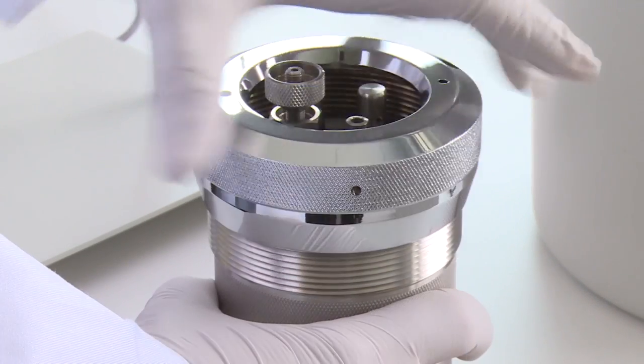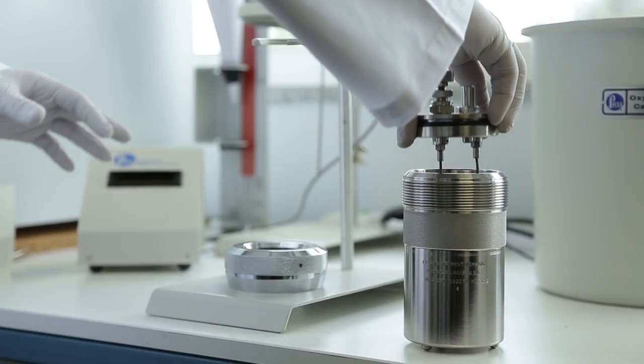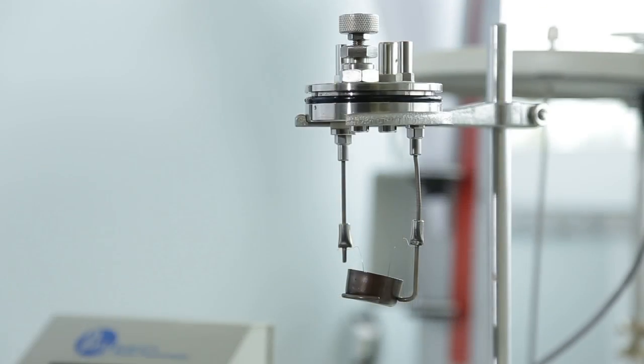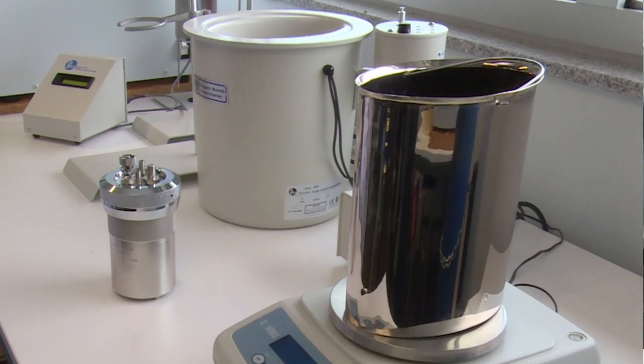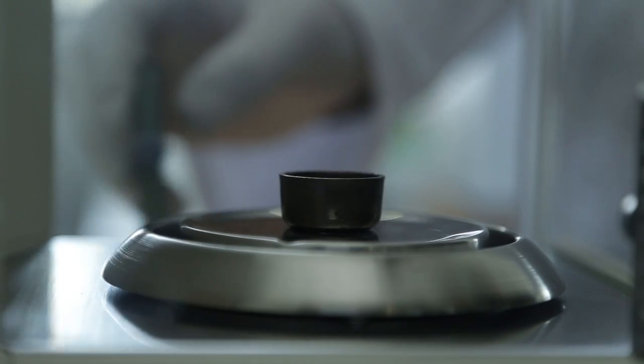Oxygen bomb calorimeter consists of the oxygen combustion vessel or oxygen bomb, the calorimeter jacket with its cover, the oval bucket, the crucible, and other accessories.